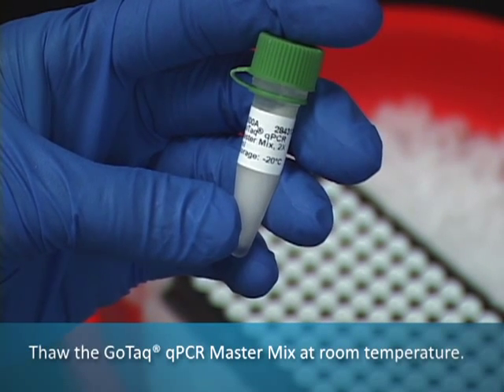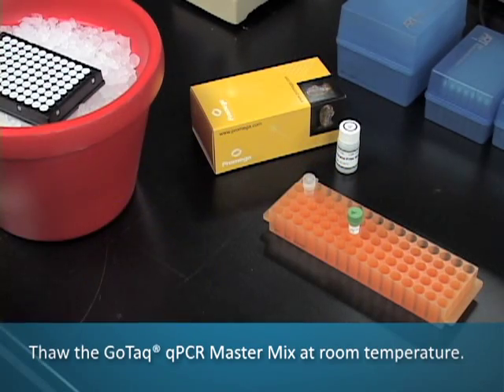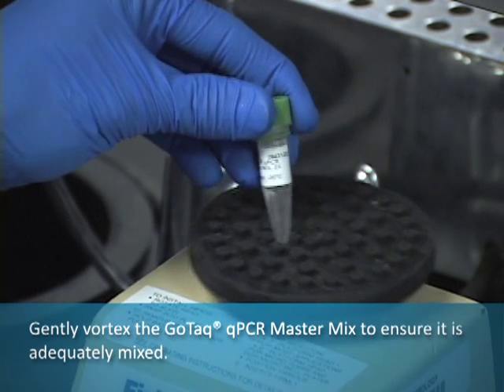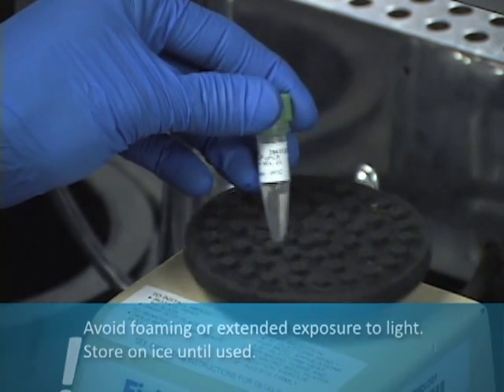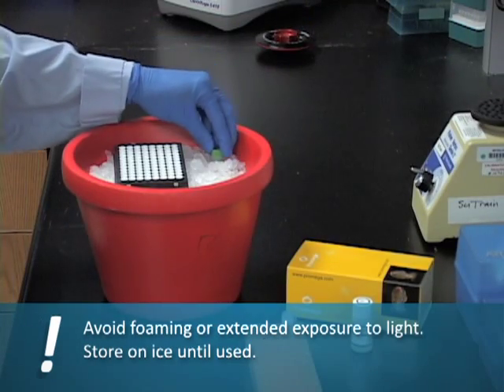Thaw the GoTAC QPCR MasterMix at room temperature. Gently vortex the QPCR MasterMix to ensure adequate mixing. Avoid foaming or extended exposure to light. Store on ice until used.